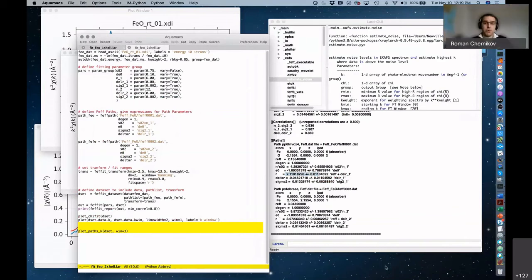There's a question from a previous spot, if you don't mind. Sure. It's related to multiple scattering. So you mentioned that the change in 1/10 of an angstrom, right? Should this change? The FEFF should be recalculated, should be rerun to recalculate the phases and amplitudes. Do you know any tool that does this automatically? No.